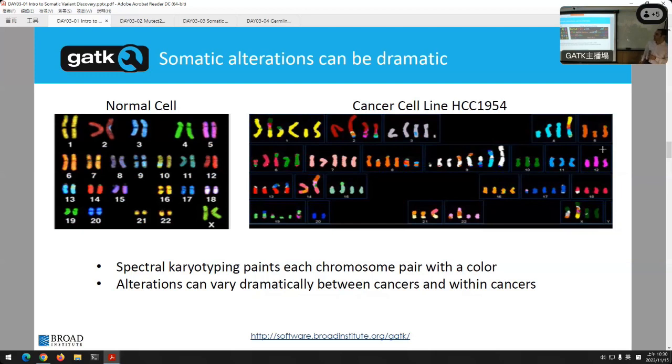We've obviously cherry picked an example that's extreme, but look what's happened to your genome. This is a cell, right? Look at the numbers of copies of chromosome 1. There are around 6 copies. But notice the other color. Sometimes you get pieces of other chromosomes mushed over onto chromosome 1. Or some of it is missing. You have whole parts of one of the copies missing.